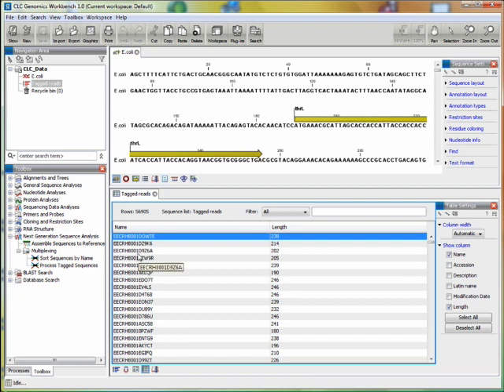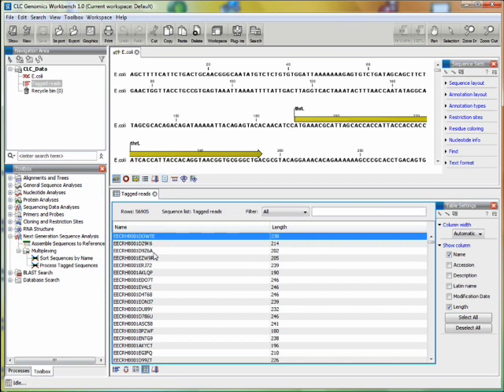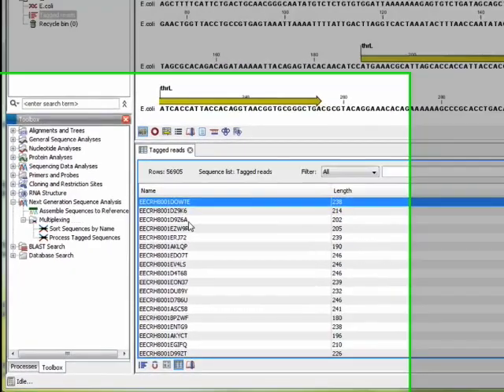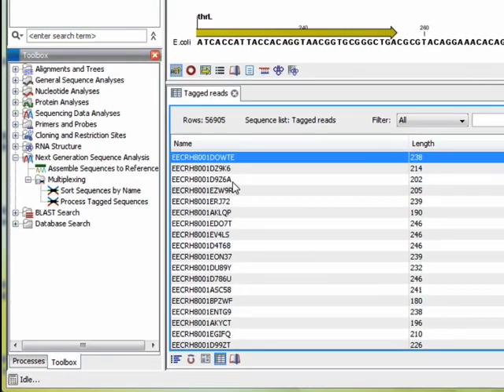In this list of reads, each read is tagged by a two-nucleotide barcode. Before we can do the assembly, we need to sort out this list based on the barcode and remove the linker or adapter part of four nucleotides from each read.